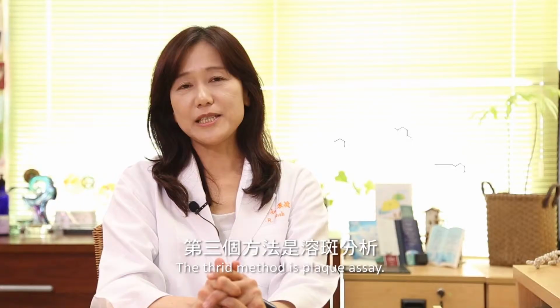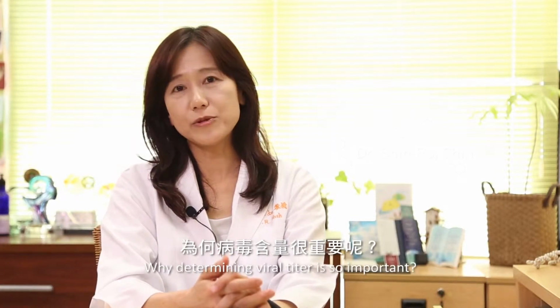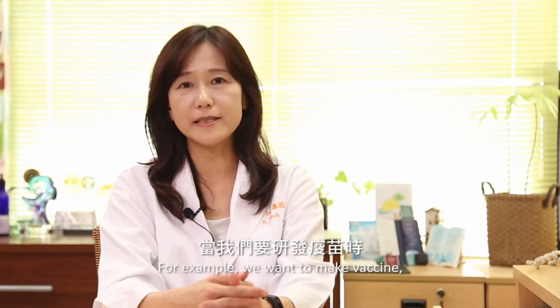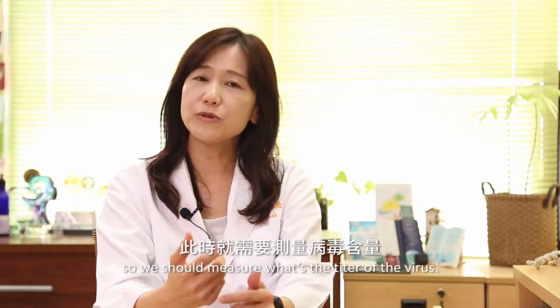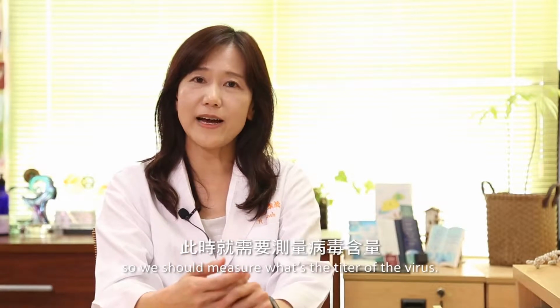The third method is Plaque assay. Plaque assay is commonly used to determine viral titer. Why is determining viral titer so important? For example, we want to make a vaccine. We should cultivate the virus to enough amount, so we should measure what the titer of the virus is.